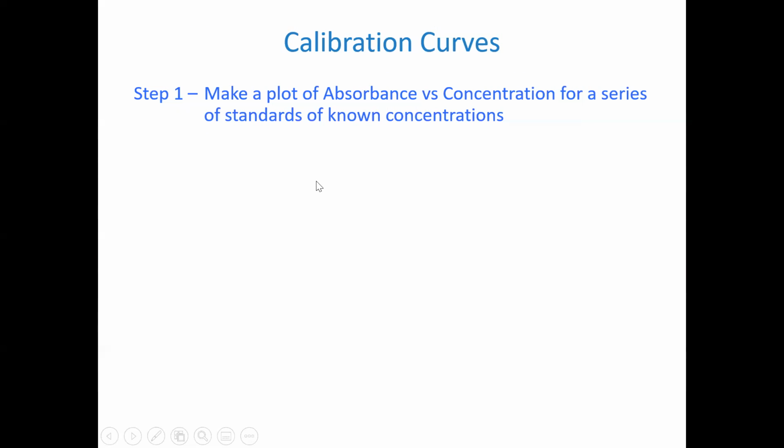Step 1 is what you do is, sometimes you might call this a calibration curve, right? So going back to calibration that we talked about before, in the case of a pH meter, the instrument needs to know what particular voltage corresponds to a particular pH. And that's part of the calibration process. And whoever programs the software inside of the instrument has all that sorted out, okay? And you just need to hit that standardize button to say this is 7, and then there you go.